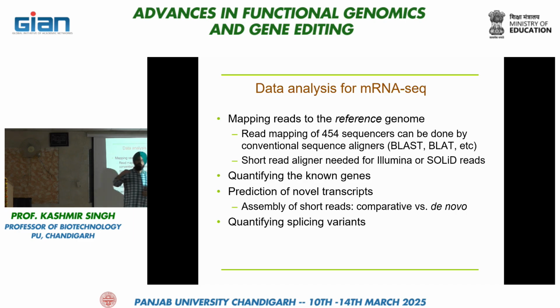So what do you do in this case? You make your sequence a database sequence and then compare other reads with it. Actually, you don't want to work with all 35 or 50,000 genes. You choose some genes. Otherwise, aligning one by one to 50,000 genes is a very tough task. We have software you can do that with also, and then you have to again check the variants manually. That is a huge task.